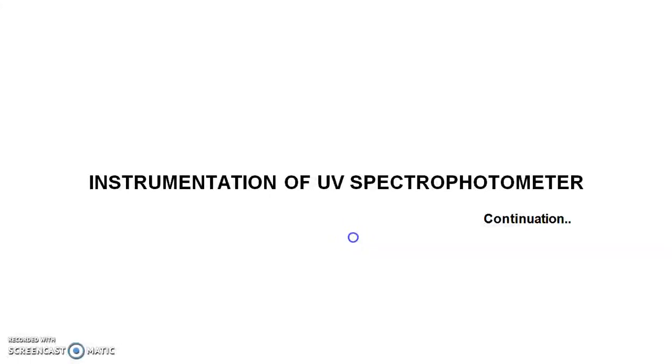Dear viewers, I welcome you all for this continued topic of instrumentation of UV spectroscopy. In this session, we shall cover the remaining part of UV instrumentation. We have been left with the detector part and the sample cells in the UV spectrophotometer instruments.